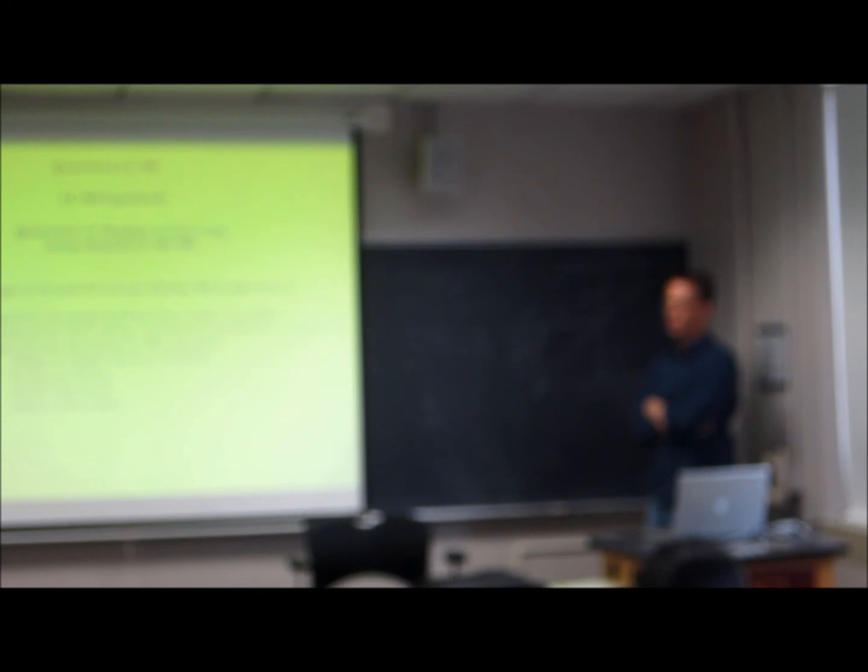It's amazing when you go into a weighing lab. I worked at NIST for 4 years. So when we did quantitation, it had to be very, very, very accurate. And we have, you know, $45,000 scales in their weighing room. And you go in there, and it's unbelievable how different pipetting 100 microliters, pop, pop, pop, and weighing each one of those, they are. Pipettes are not very precise. And the volume they give is good for everyday lab applications, but not for highly accurate quantitation.